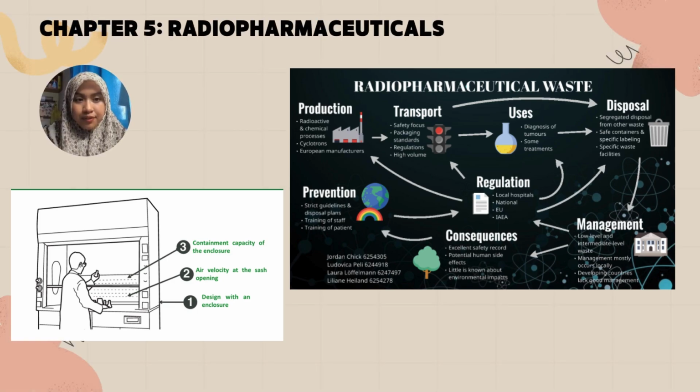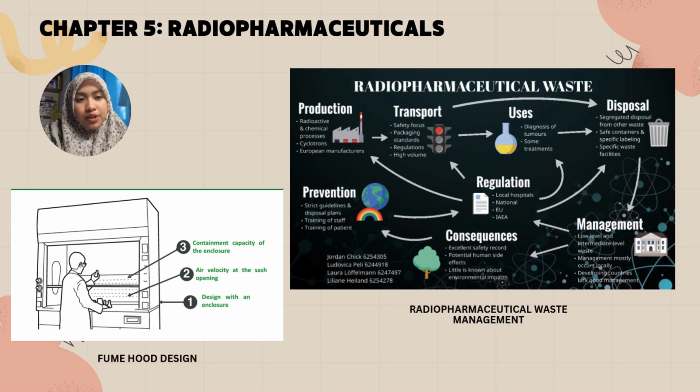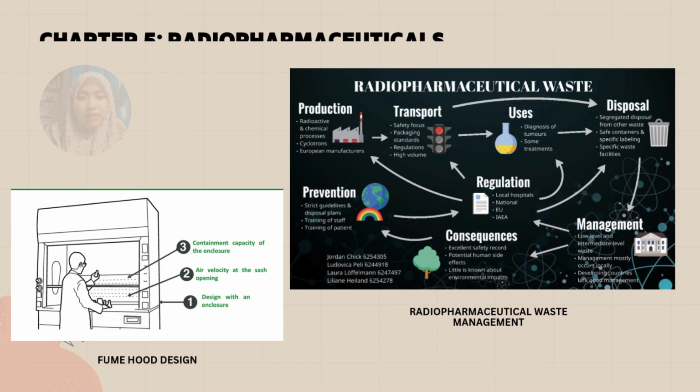Besides, I also prepared the radiopharmaceutical waste image, and you can see the processes that are involved in the form of radiopharmaceutical waste. And the second image is about the fume hood design.